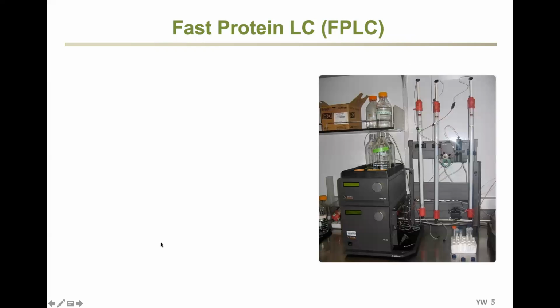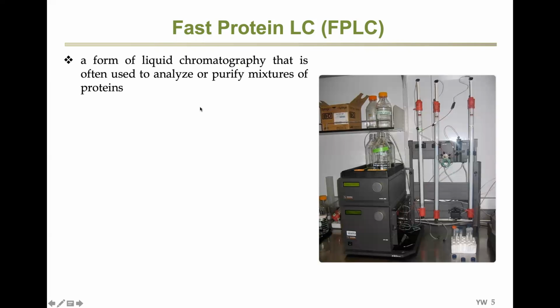Now, quickly to mention fast protein LC, which has a specific name, FPLC. This is also a form of liquid chromatography, and is mostly used to analyze or purify mixtures of proteins. Okay.